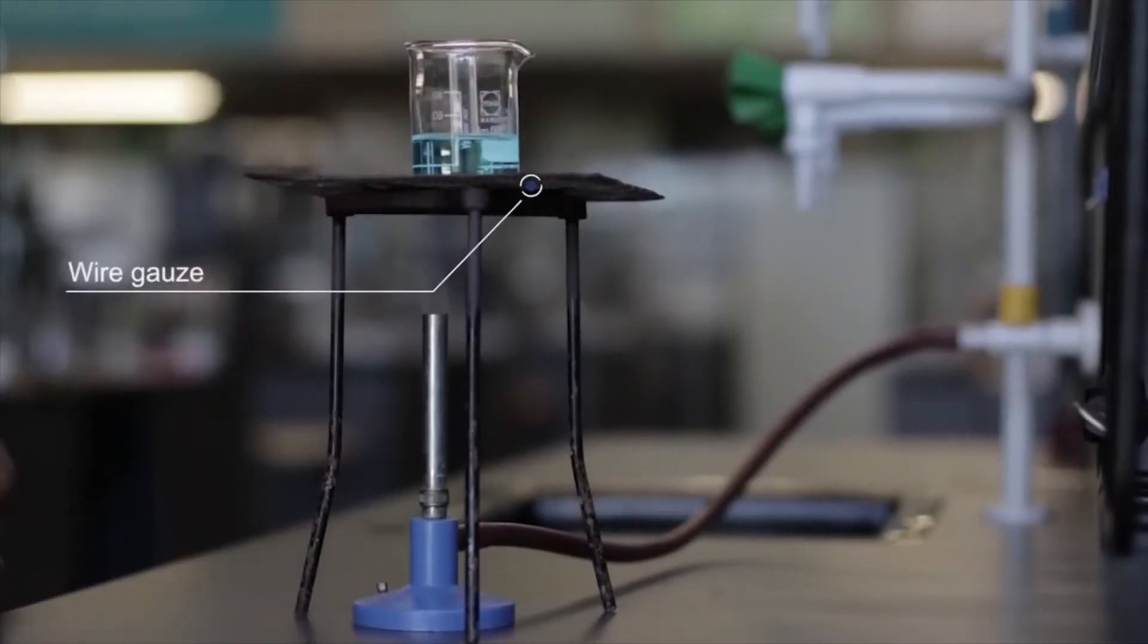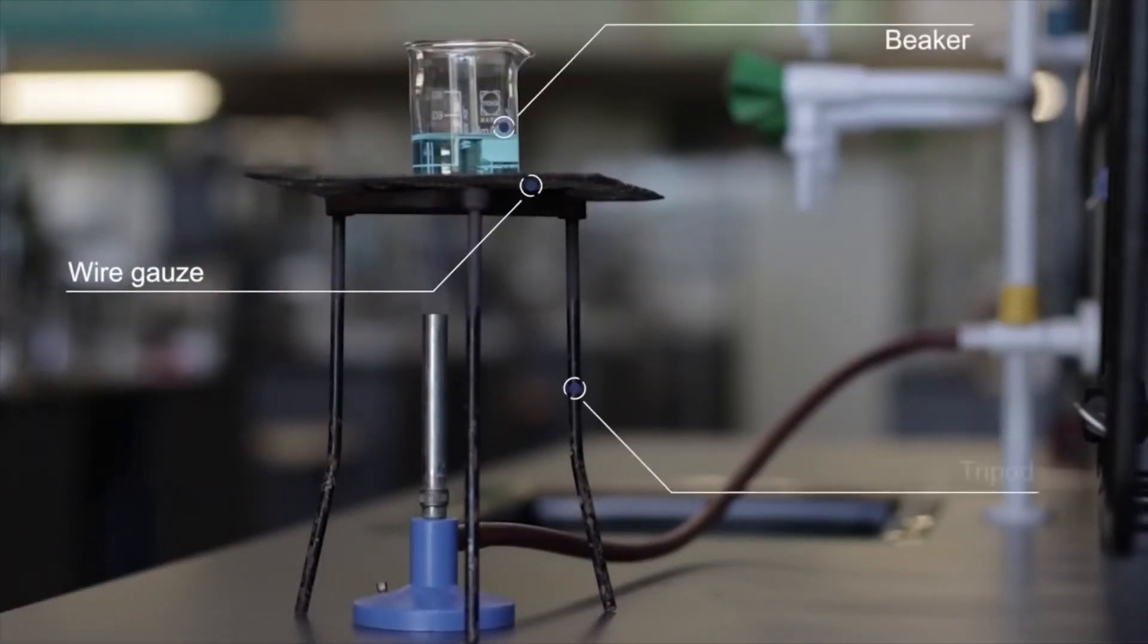Wire gauze is placed between the beaker and the tripod to support the beaker while heating the solution with a Bunsen burner.